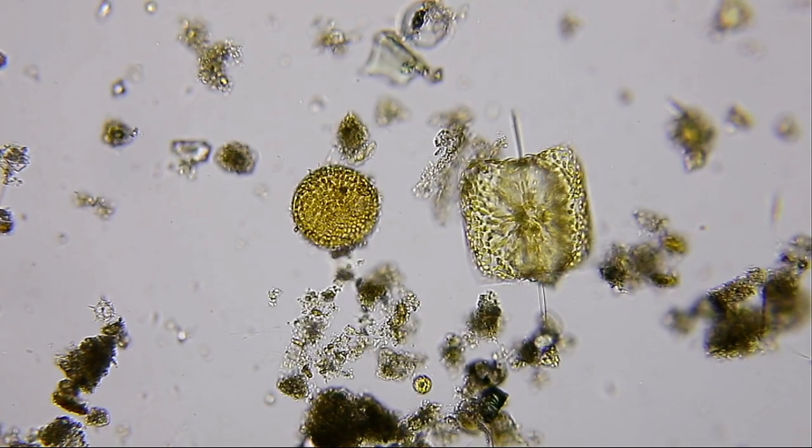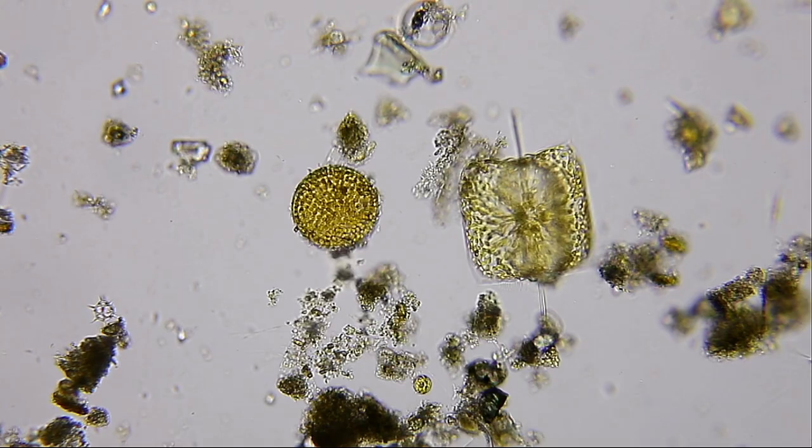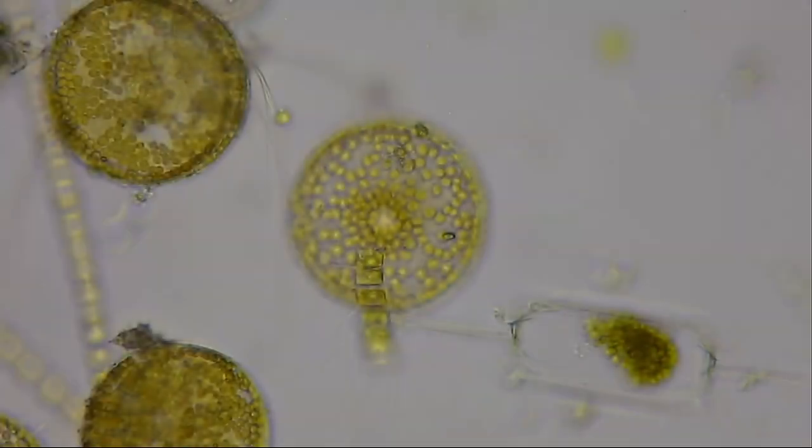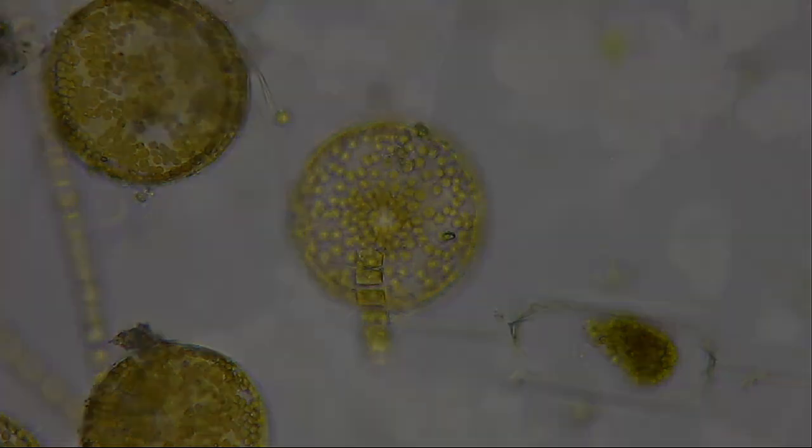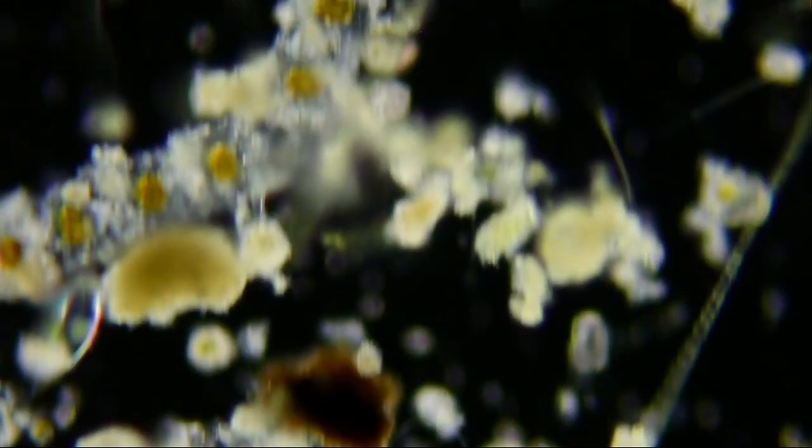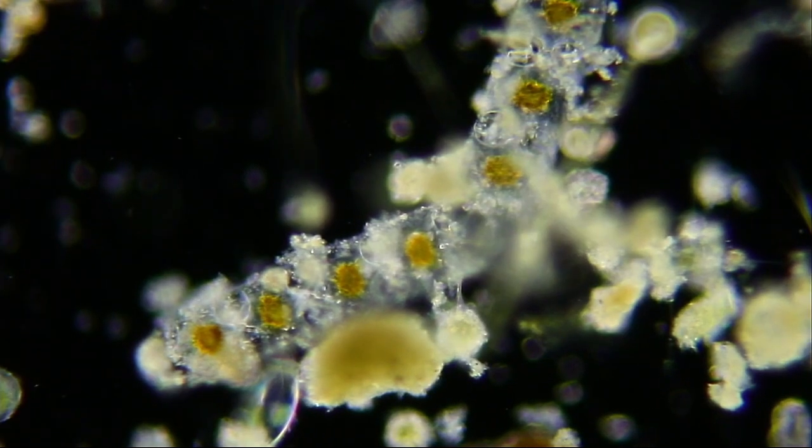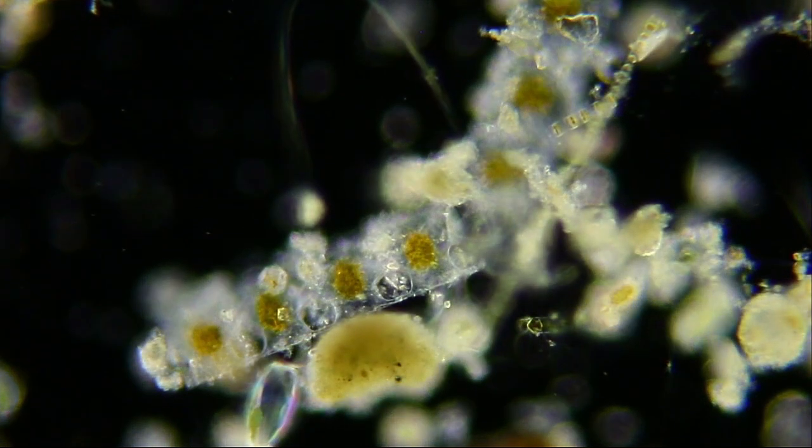This is Ditylum, a common local diatom. There were large, round, distinctive centric diatoms present in every sample. And this long, blurry, goop-covered chain of a beautiful diatom called Odontella.